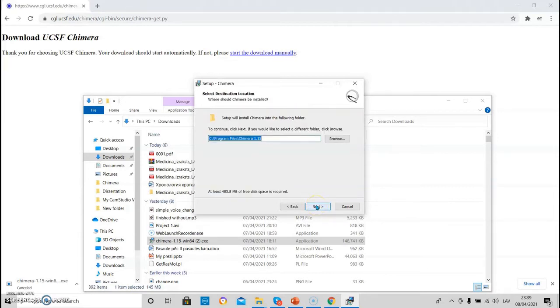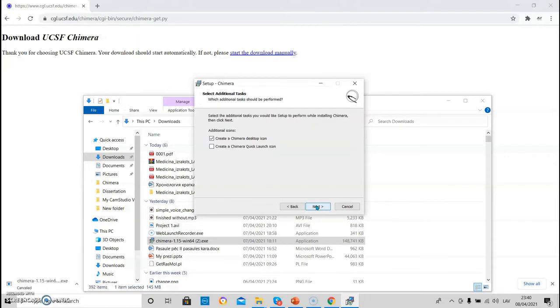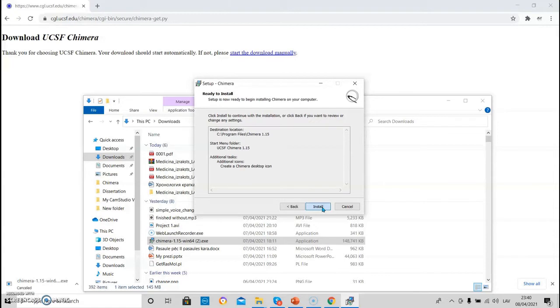Again, press next. Choose the folder where you want to deposit it. Next. Then choose a location where you want to deposit a shortcut and next. Better click create a Chimera desktop icon since it makes it easier to find and launch it.